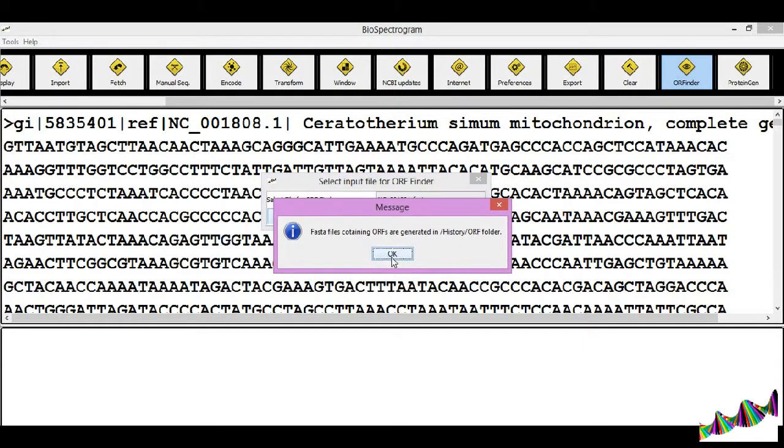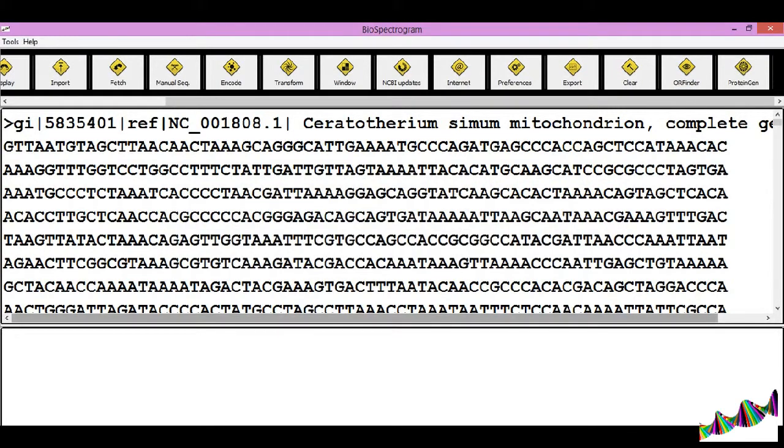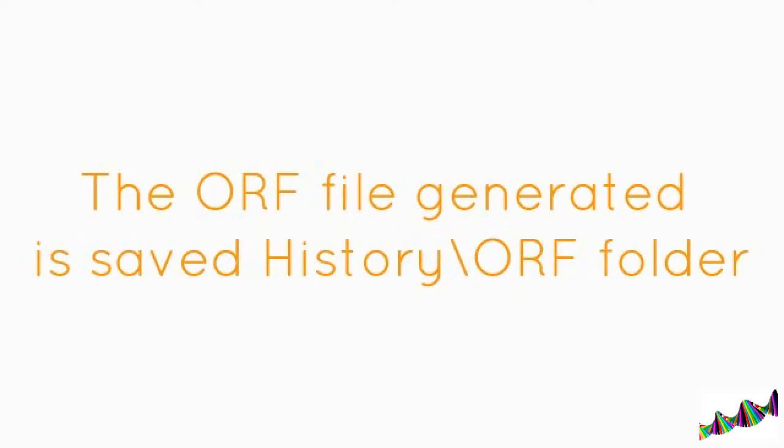The FASTA files containing the ORFs are generated in the history under ORF subfolder. Also, the text file containing the entire list of ORFs is generated in the ORF subfolder.